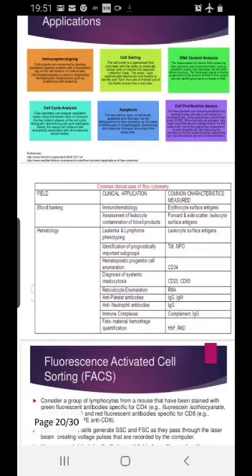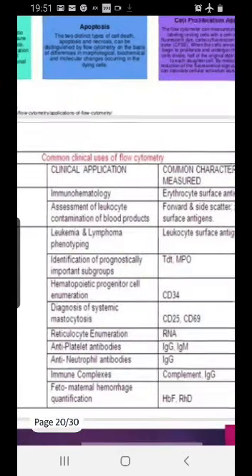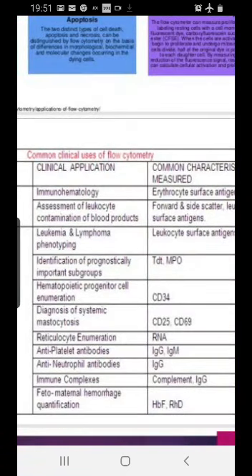And even in blood banking, it has a very important use, especially in irradiated patients. In irradiated patients, we don't have any immune cells. So if you want to transfuse PRBCs, which are RBC concentrates, we don't want to infuse any leukocytes, because if you infuse leukocytes, there will be an immunological reaction, a transfusion reaction or GVHD.